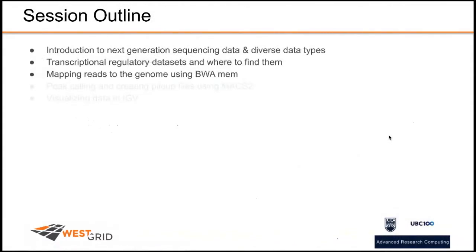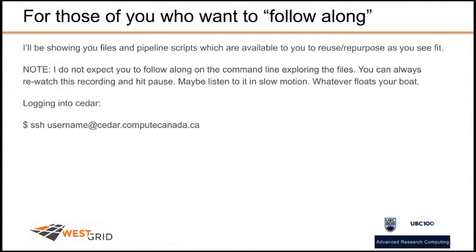So now we're going to go into the process of mapping reads to the genome using BWA-MEM. For those of you who want to follow along, I'm going to be showing you files and pipeline scripts which will be available for you to reuse or repurpose as you see fit after the session. I do not expect you to follow along on the command line while exploring these files, and you can always rewatch this recording and hit pause, maybe listen to slow motion, whatever makes you happy.